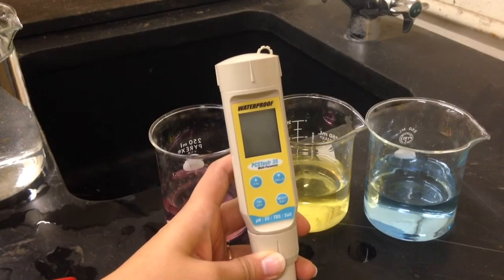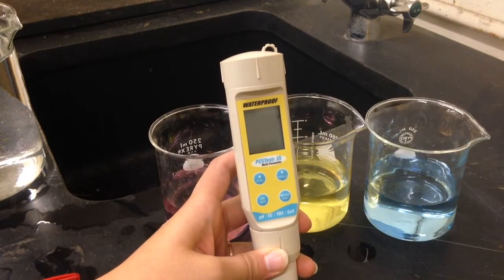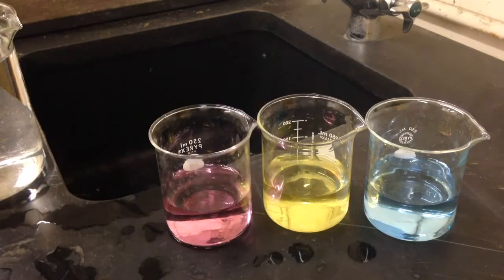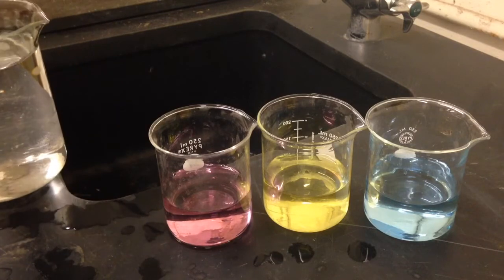Hello, today we are going to learn how to calibrate the Oakden multi-parameter pocket meter for pH. In order to complete this calibration process, we need a few materials. First of all, we need a large container filled with tap water to rinse our meter in between calibration steps.